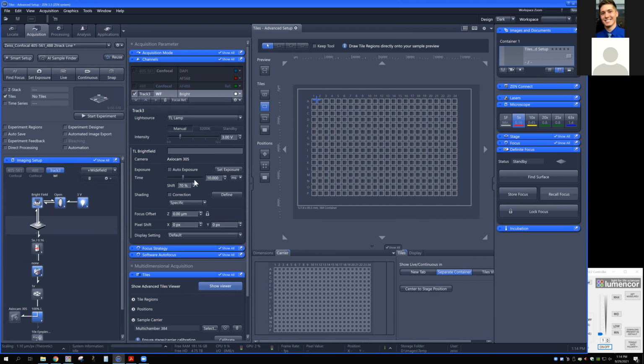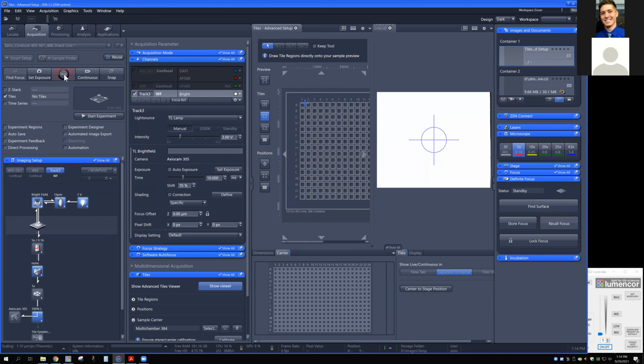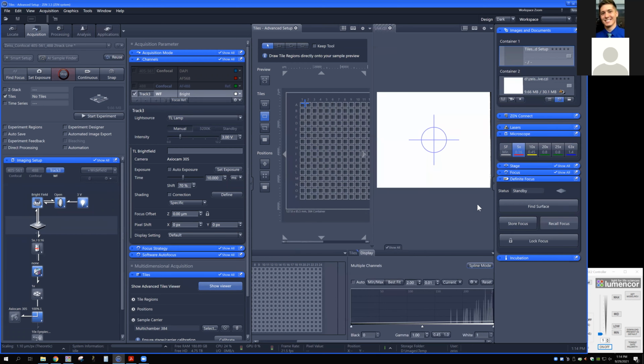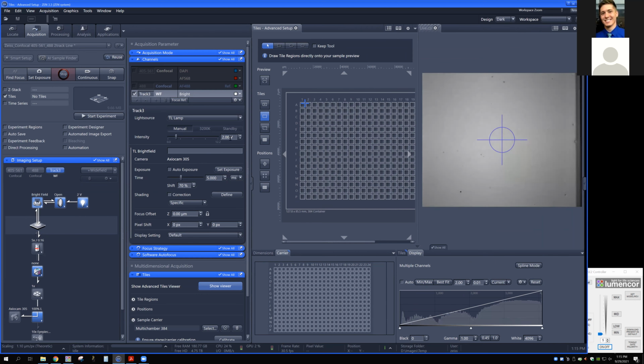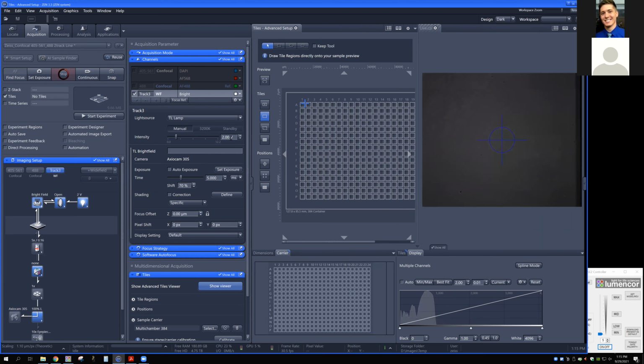I'm guessing that those settings will be all right. So let me maybe go live and see what we're looking at. Super bright. All right.